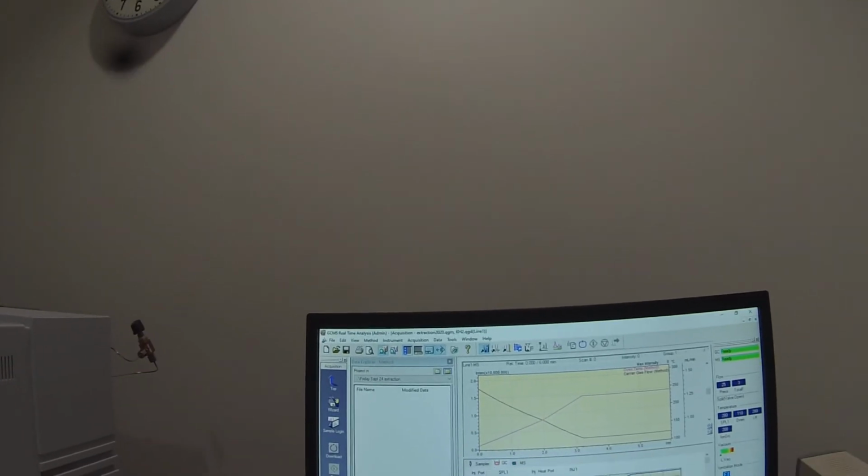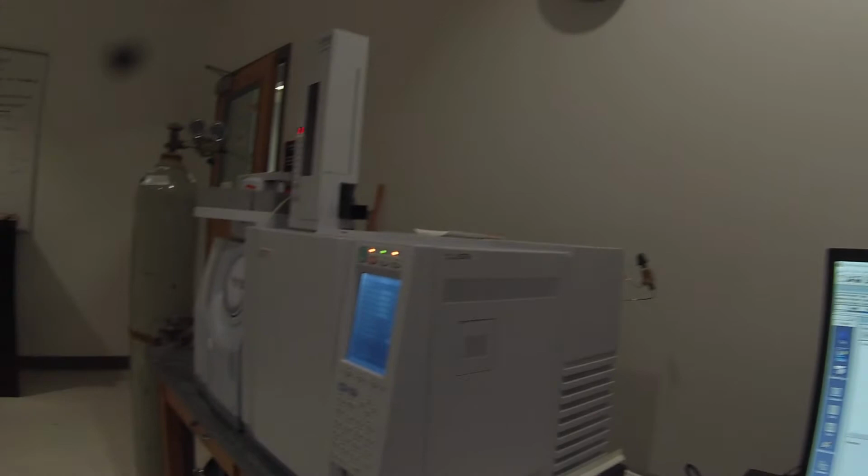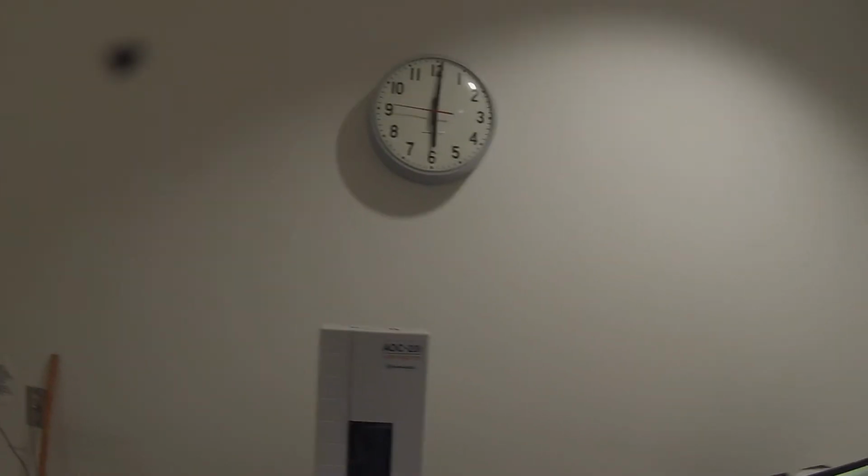So I'm just going to go to the batch file and hit the start button, and it will adjust the parameters and tell the auto sampler where it can find my various samples. And then we'll watch the automatic injector do its thing. And then we can go away and run some thin layer chromatography while we're waiting for this thing to collect and get a new mass of the beaker so we can get an accurate % recovery of the tryptamine.